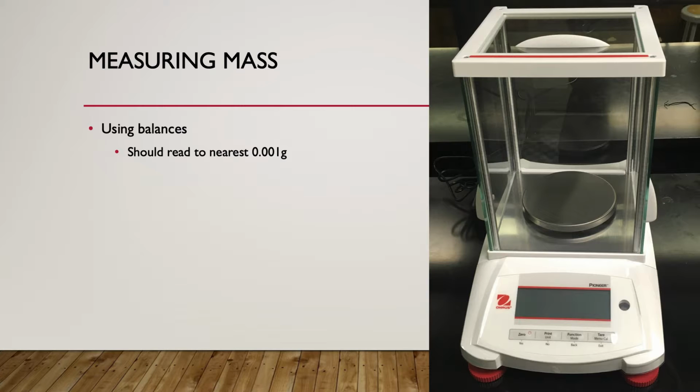Now, I'm not going to go over all the full significant figure rules here in the pre-lab video, because most of you are going to be seeing it in lecture, and the CSE Pub part of this lab isn't really going to test you on significant figures, although we will introduce them from a measurement standpoint. For all of our masses this semester, it's the nearest milligram, or nearest 0.001 grams, because that's how accurate all of the balances we're going to be using are.